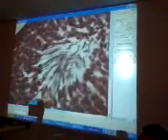And then these guys in the middle are your sperm cells, the actual semi-functional sperm cells with the tail. How do you tell the difference between the stem cell and the primary? The stem cells are just dark, in interphase, so they have no chromosomes showing. With the primaries, you're going to start to see chromosomes, better on this microscope than on projection, but you can make out chromosomes by the time it gets to primary.